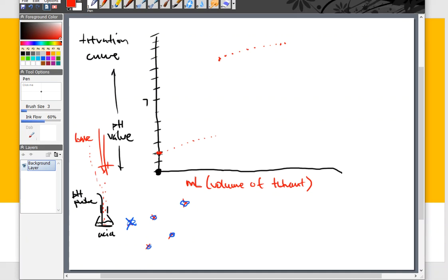So what happens is that on a titration curve, I typically see this gradual increase that happens in the beginning. And I see this gradual increase that happens here at the very end. That is why they have slight curvatures that are associated with them. But in the middle here, when it skyrocketed, that is an important point in the titration curve. Because folks, right here in this inflection point area, okay? That's where this graph begins to change direction.